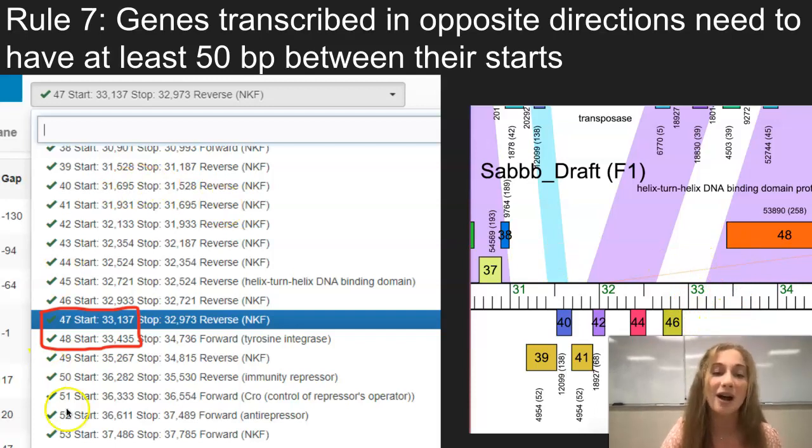And if we look at this pecan, it is the same exact place, this 47 to 48 where it switches from reverse to forward, there is indeed a 50 base pair gap between the two genes right here.